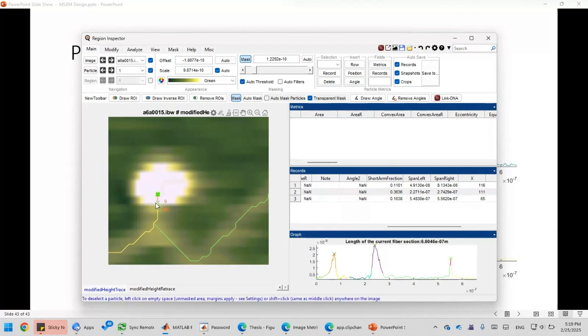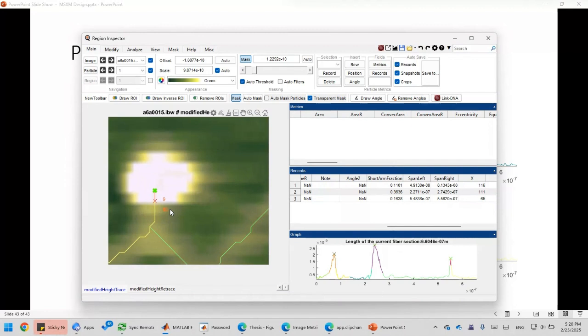So 9, I think it's at the, maybe it's 9, 10. I cannot see them clearly, but I think 9 is probably at the center of that. I think this is 8 and 10. That's this one. Maybe we can move this a little bit. That is 10. That's 8 and 10. This is 8. So it should be right.